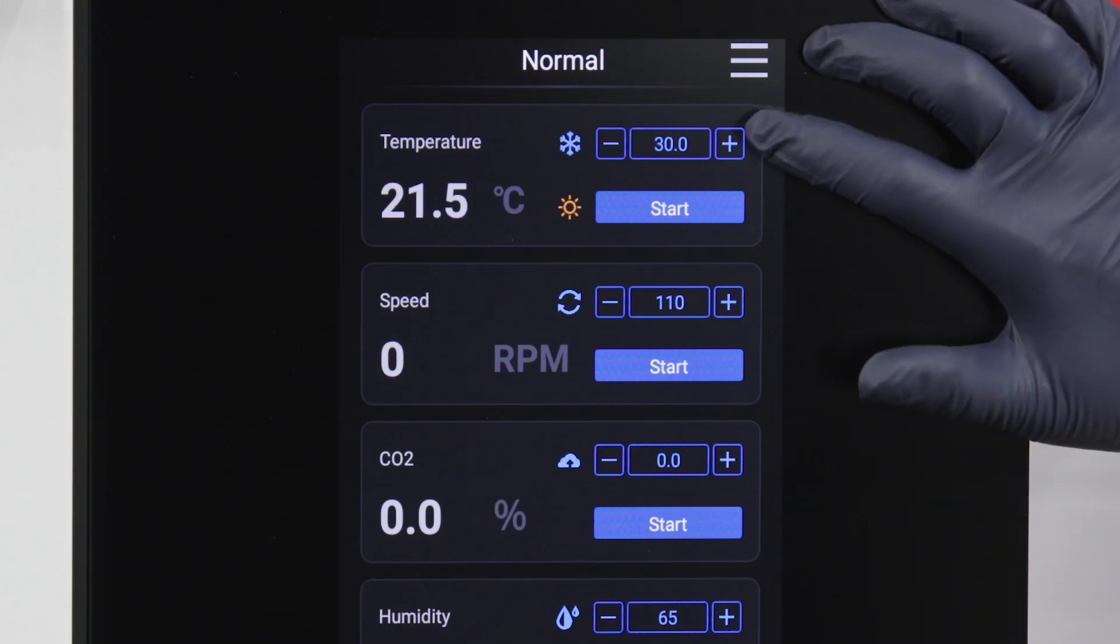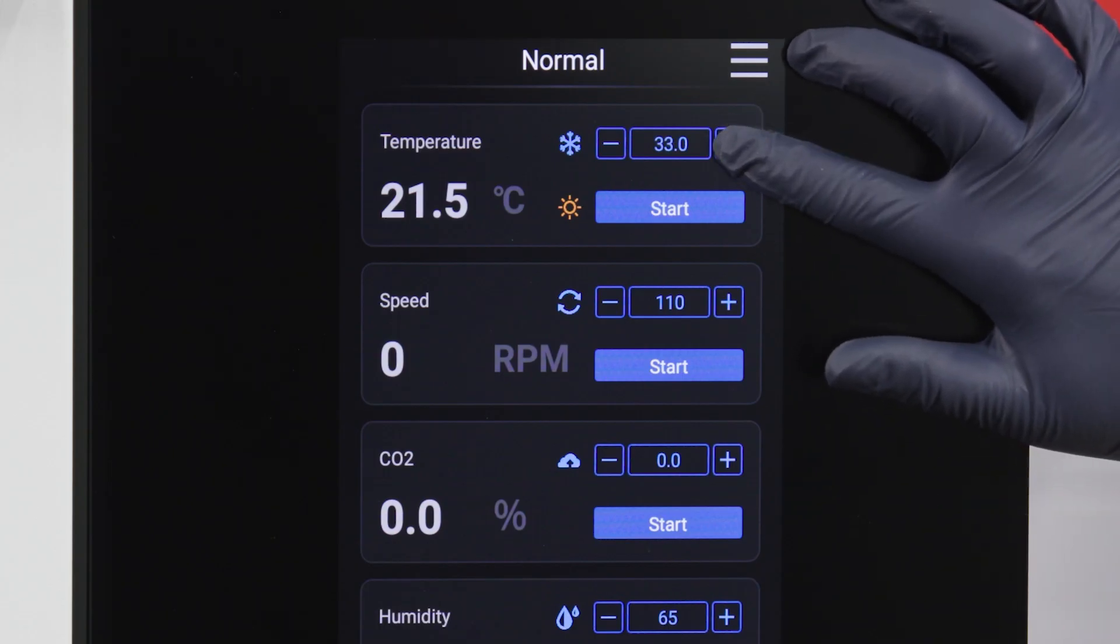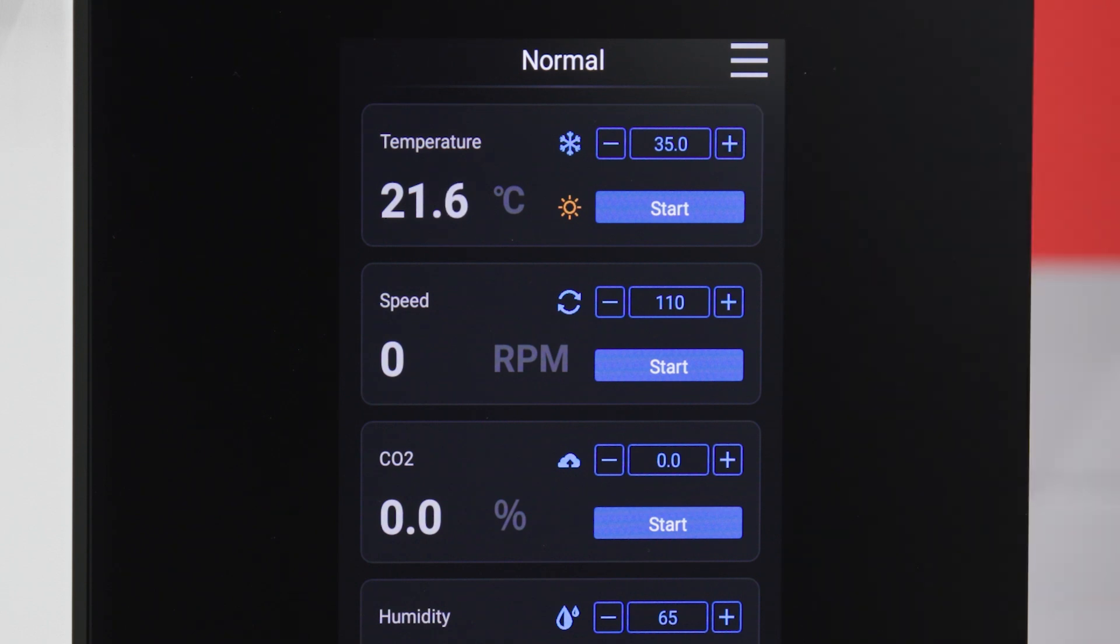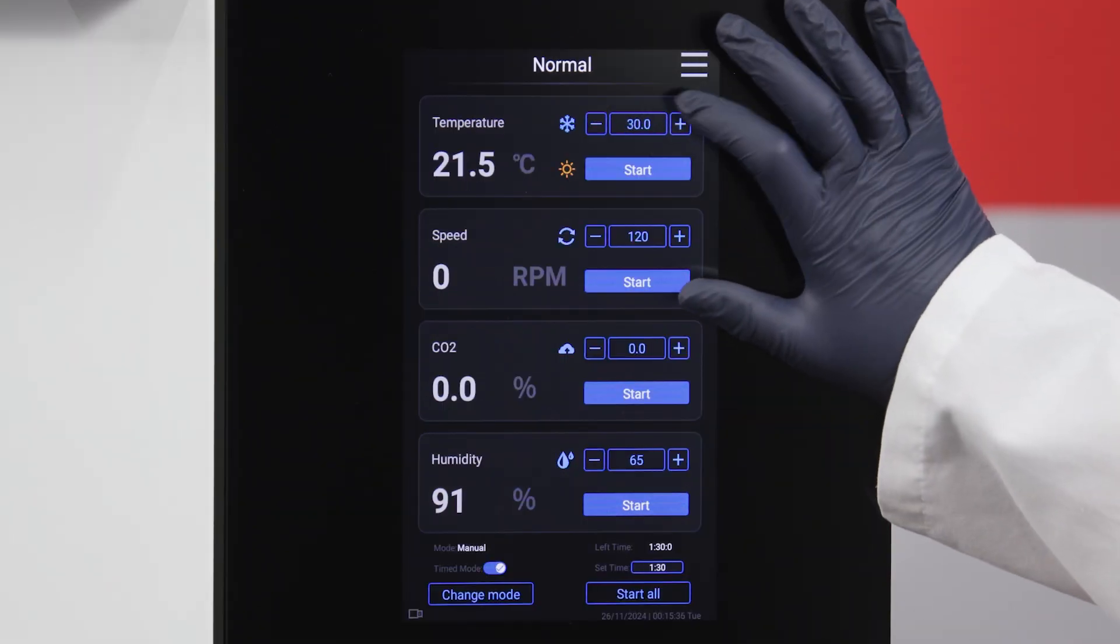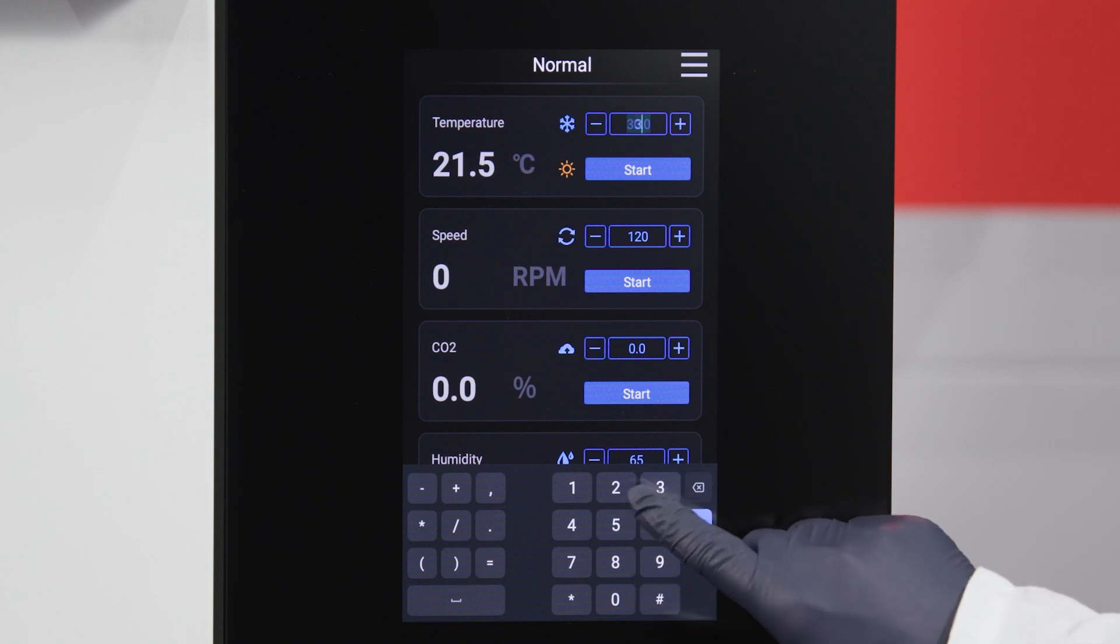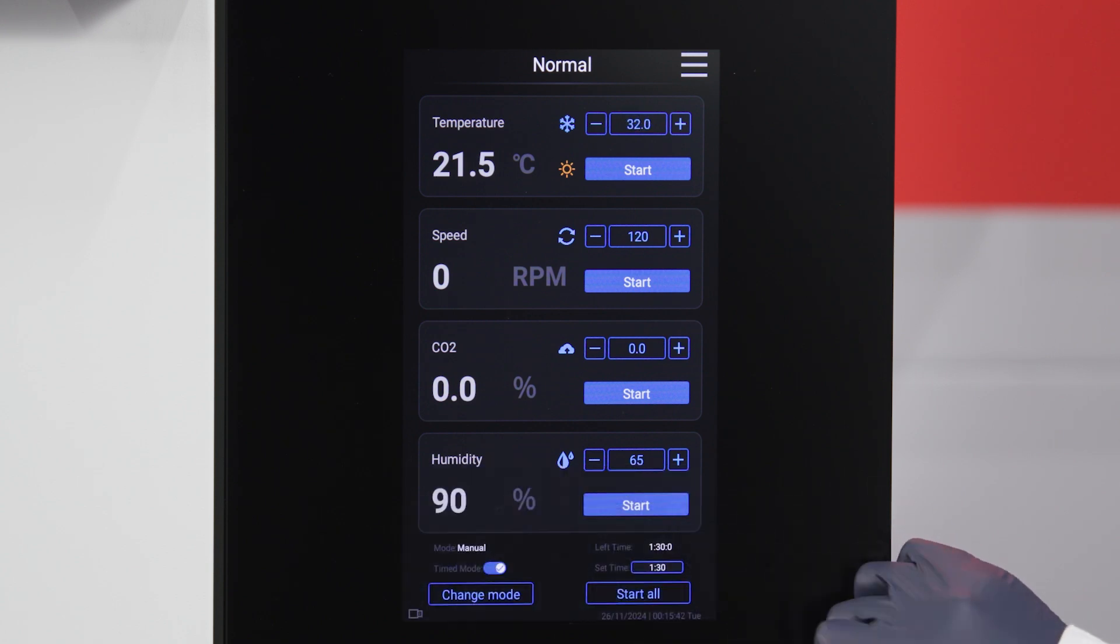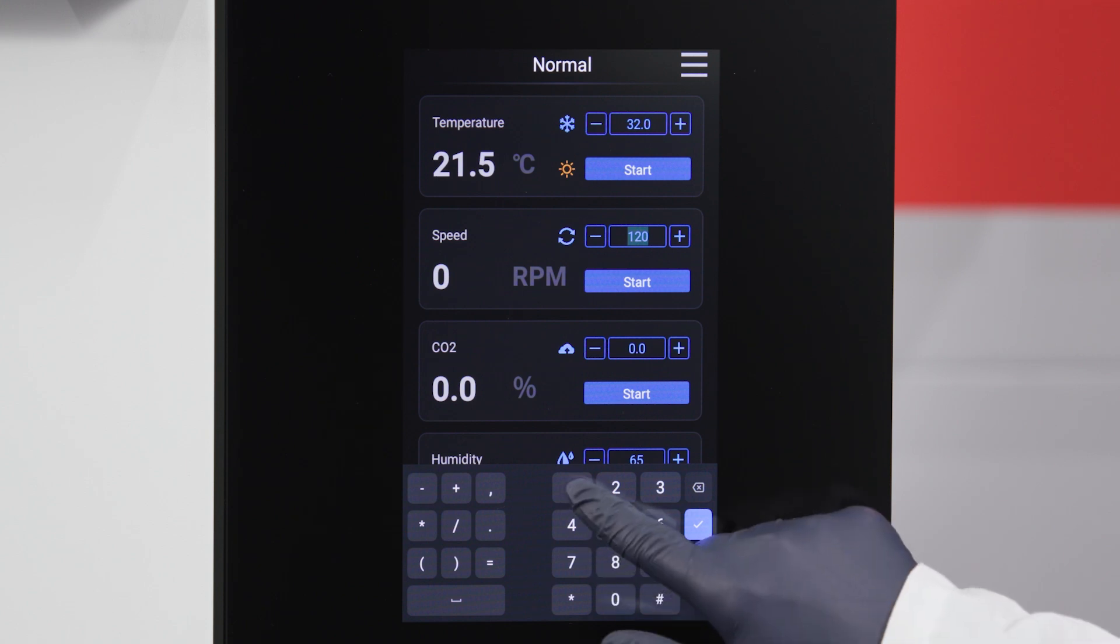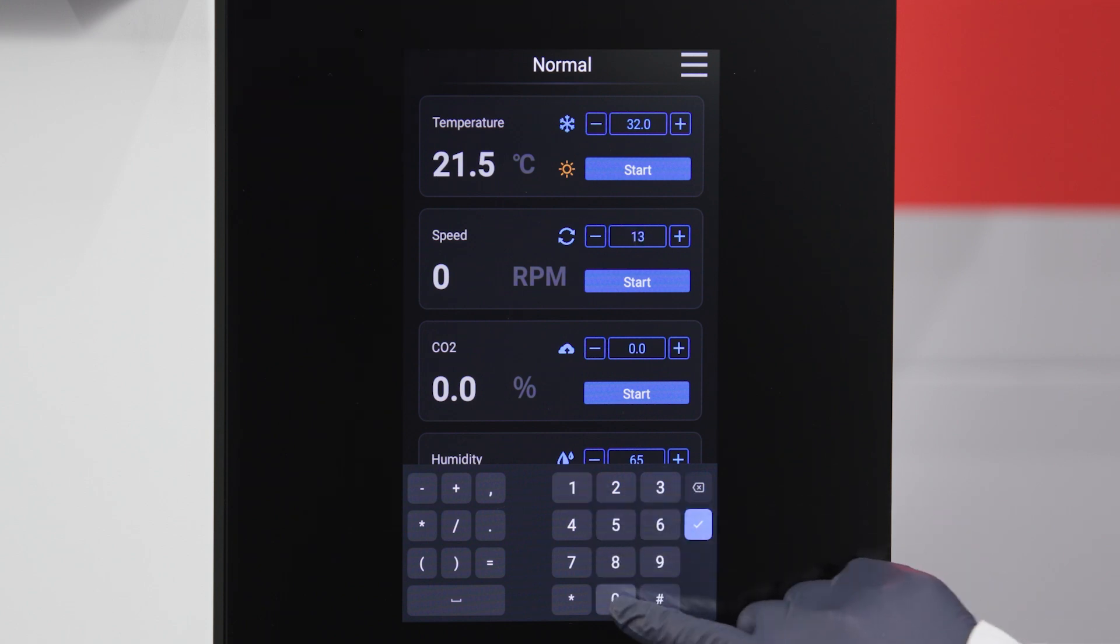Set the temperature, speed, CO2, or humidity by pressing the plus and minus buttons in the appropriate panel. You can also tap the number between the plus and minus buttons to display a numeric keypad that allows you to type in a number. Tap the check icon to return to the main interface.